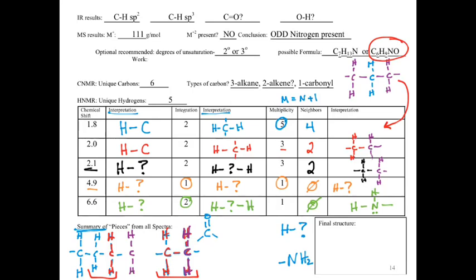If that's the case, our red hydrogen could be set up as a kind of duplication, except what's the issue with that? It now has 4 hydrogen neighbors. We only have one signal with 4 hydrogen neighbors, and our blue one also has 4 hydrogen neighbors. So that overlay didn't work. What does that mean? Well, that means we should continue to overlay. Instead of putting our red carbon on that position, let's overlay it one further over.